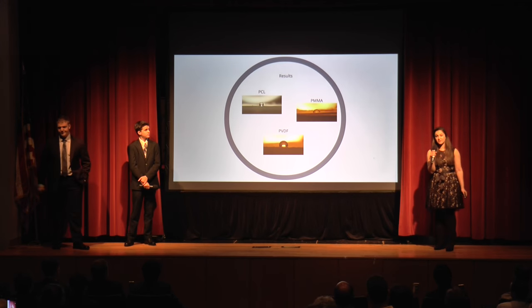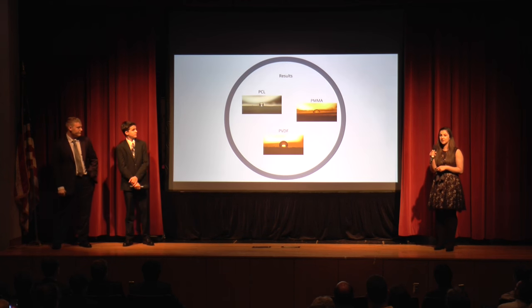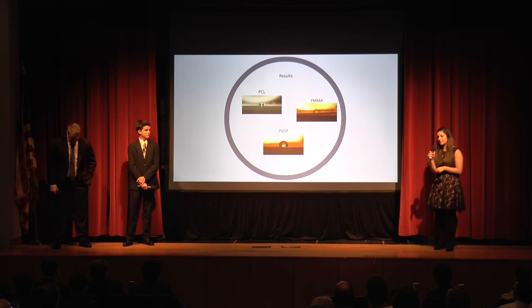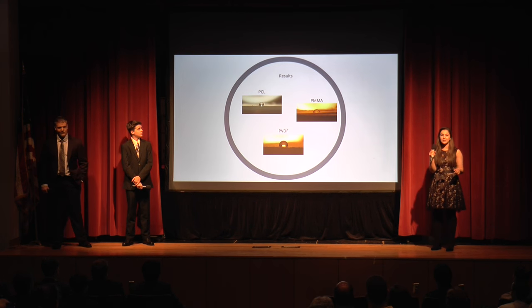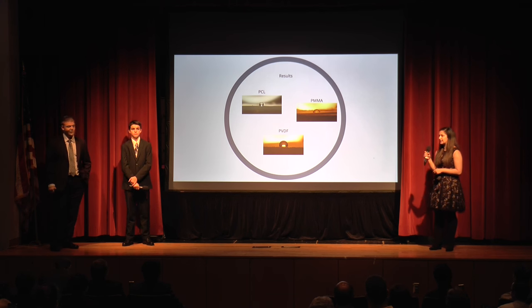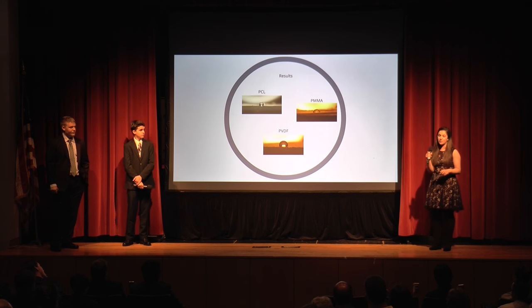So these are examples of our results. The way we tested hydrophobicity was by dropping a single droplet of deionized water onto the nanofibers, and then we analyzed it in a software called ImageJ. We analyzed contact angle, which is ideally 120 degrees, and we did that by measuring from the bottom of the droplet of water to the outermost edge. Prior research has it that PMMA would perform the best, however, it didn't, and we actually had polycaprolactone perform the best.